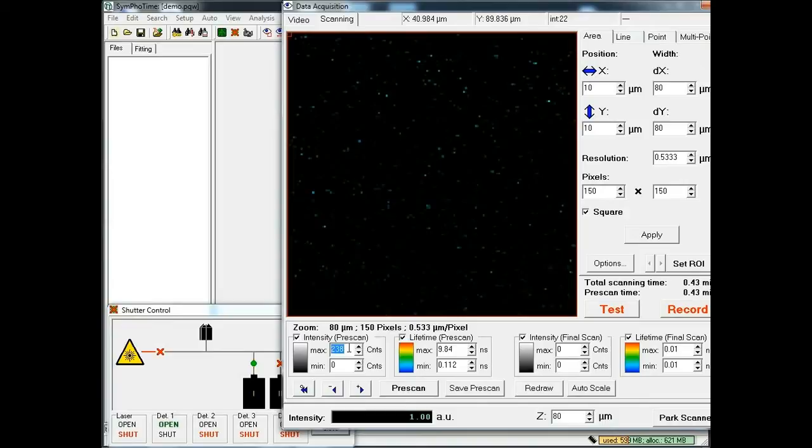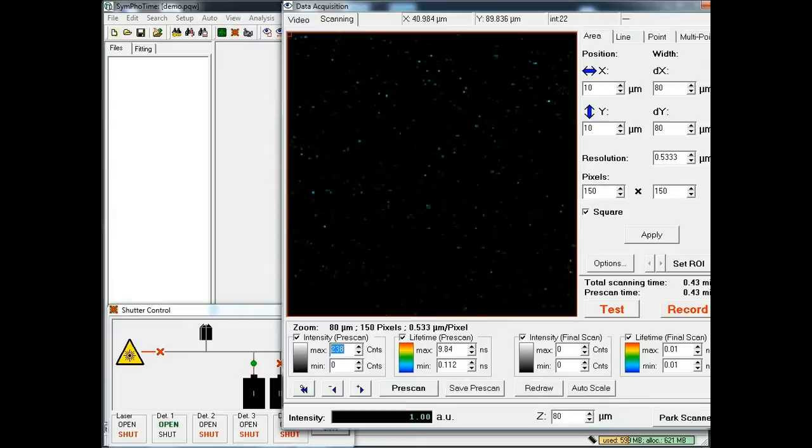This image looks a little bit speckly and those are probably the single molecules I am expecting to see, but we can't really see them here in this big field of view because our resolution is not high enough. So we can make this a little bit brighter by changing the scale and selecting a region of interest where we will zoom in. I can switch this window to 'set region of interest' mode and select a frame where we will have a closer look. Then I select the resolution — let's say 250 pixels by 250 pixels — apply this, and start recording the image.